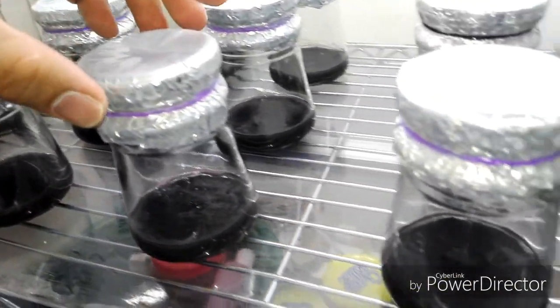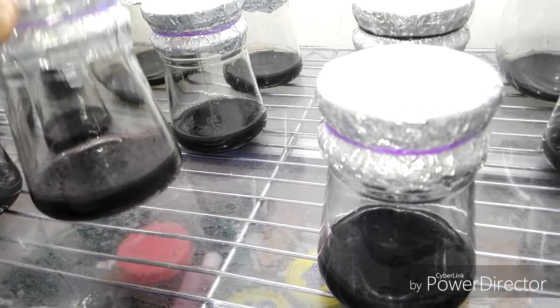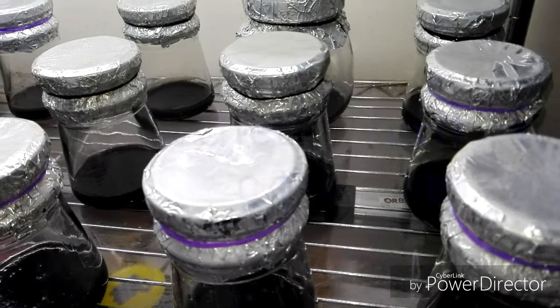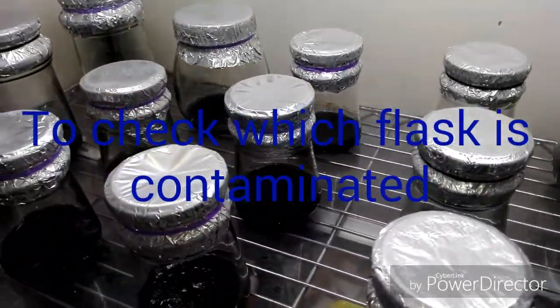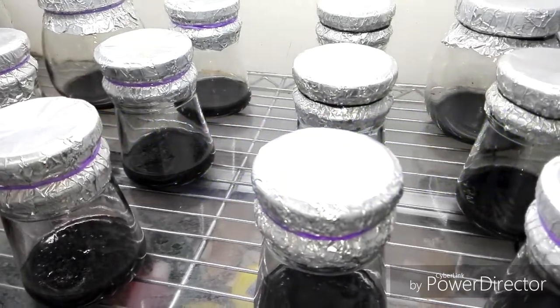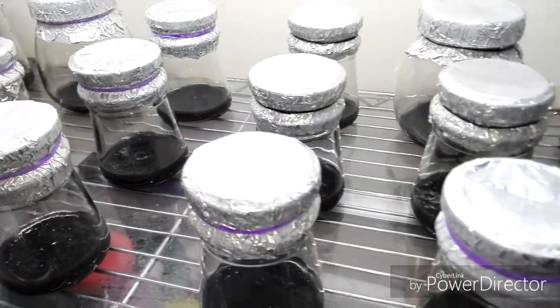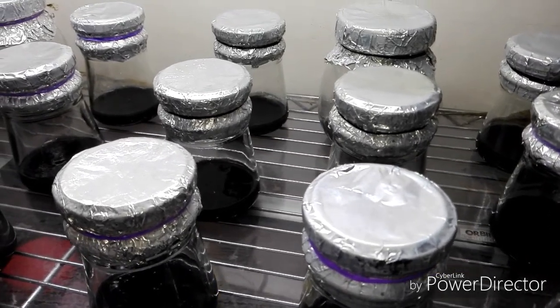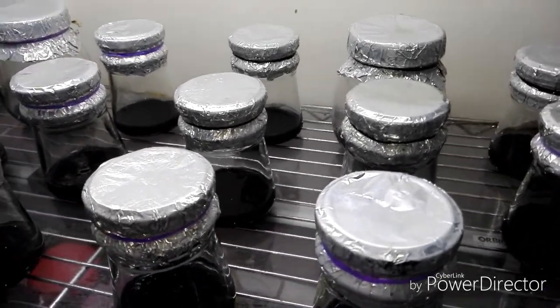I will most probably wait about 7 days before the next sowing of orchid seeds. Unfortunately I lost 5 bottles because they got broken inside the pressure cooker during the sterilization process.